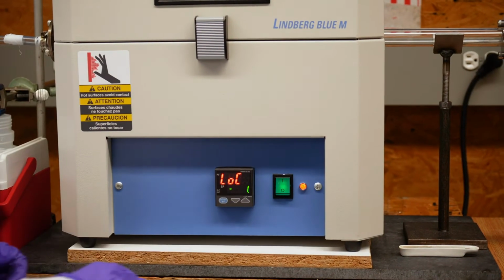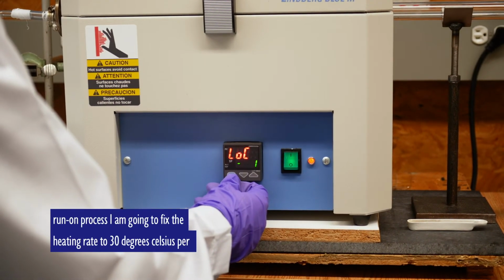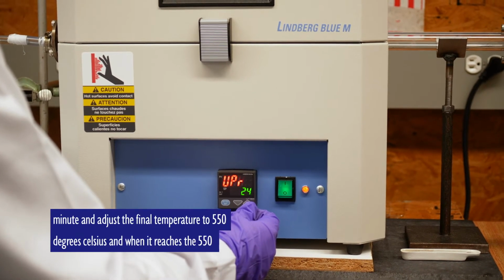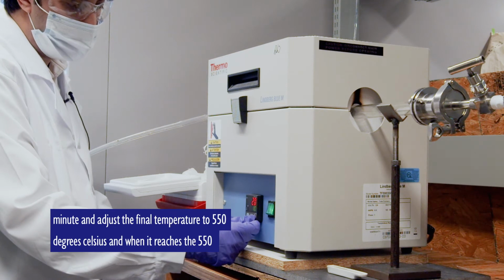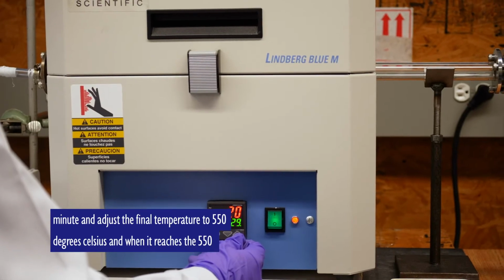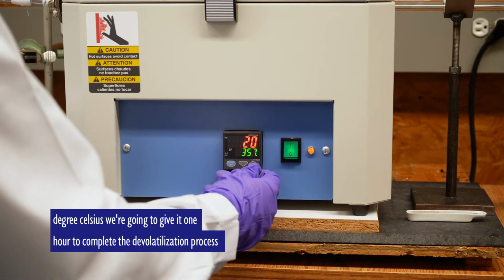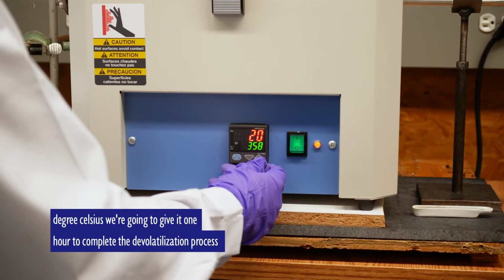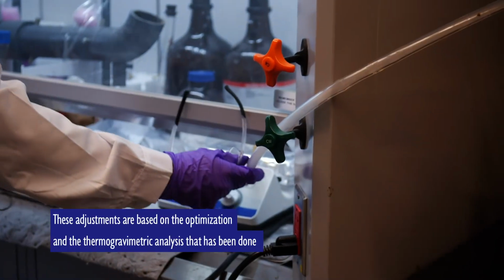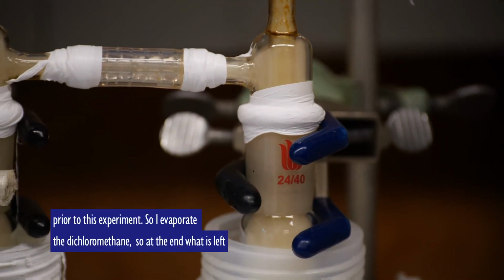For instance, for this run and process, I'm going to fix the heating rate to 30 degrees Celsius per minute and adjust the final temperature to 550 degrees Celsius. And when it reaches 550 degrees Celsius, we're going to give it 1 hour to complete the devolatilization process. These adjustments are based on the optimization and the thermogravimetric analysis that has been done prior to this experiment.